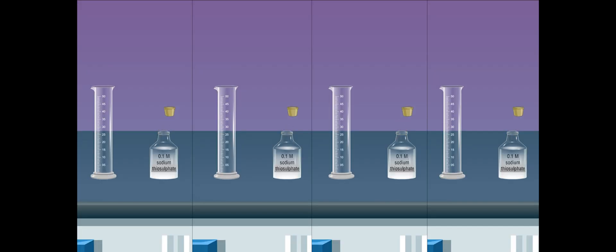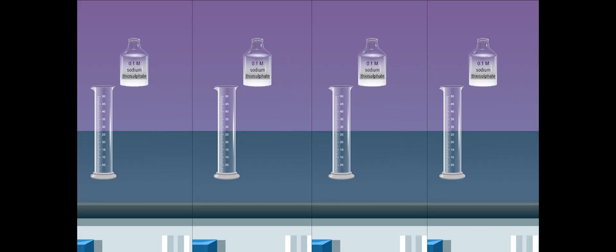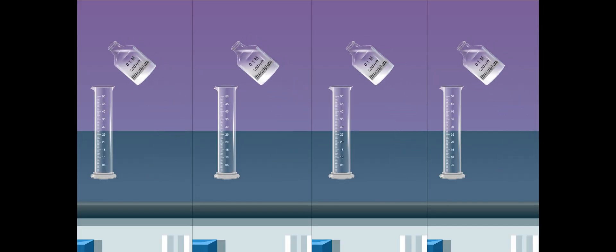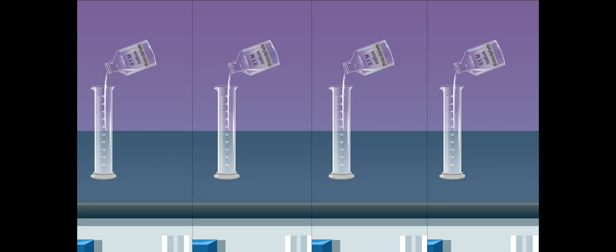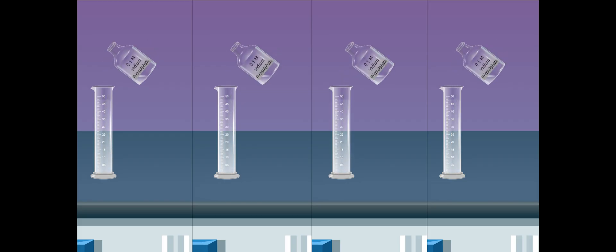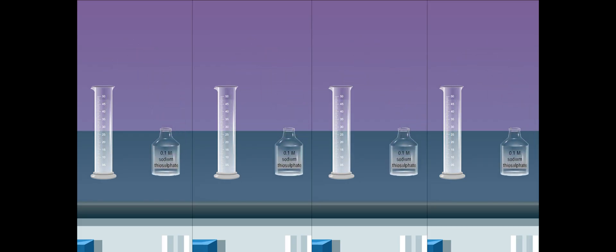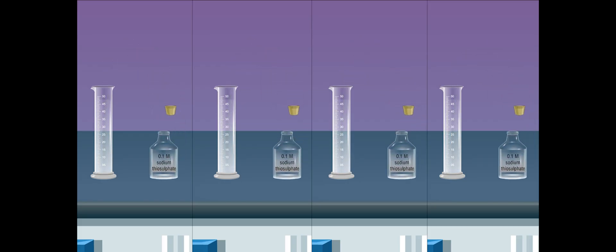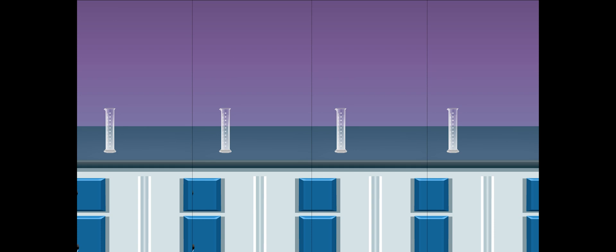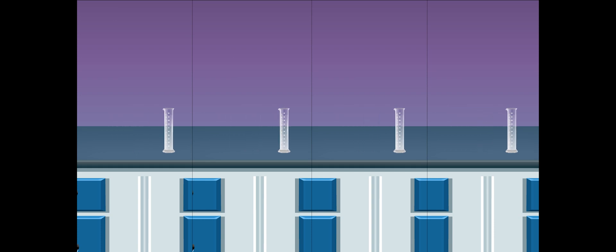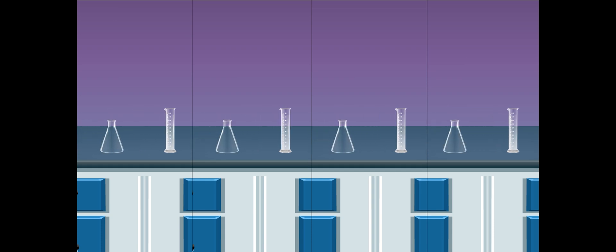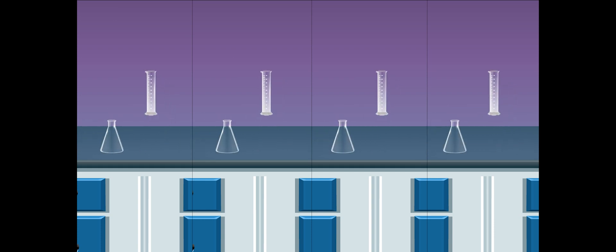Repeat the experiment by increasing the temperature by 20 degrees Celsius, 30 degrees Celsius, and 40 degrees Celsius from the room temperature. Be safe.